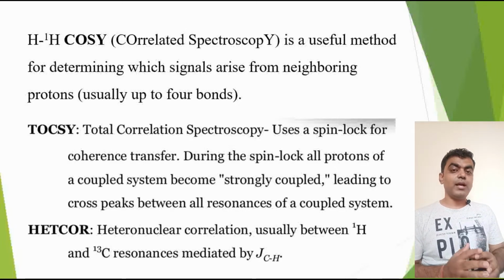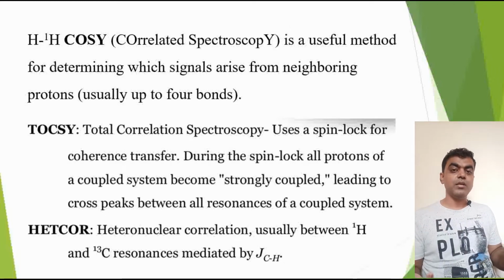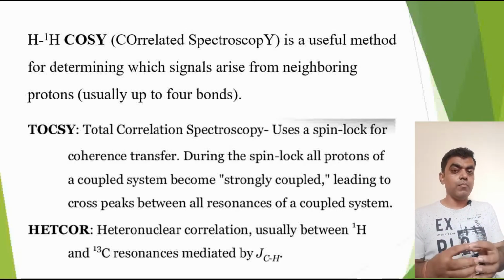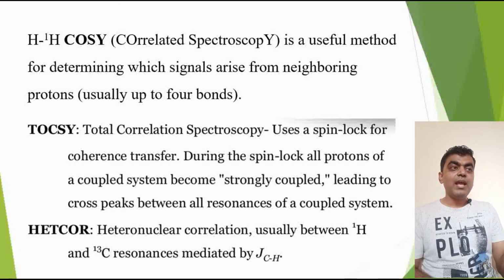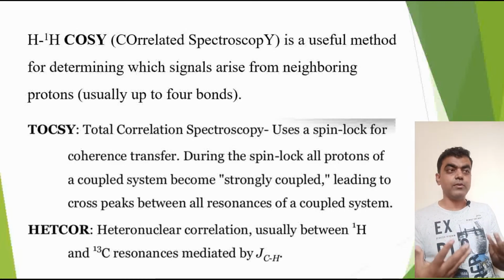Right. So usually when I used to do it, we faced that 3 bond length is very good. We can extend to 4 bond lengths also, depending on how simple or how complex your molecule is, right? So we have to have information on the bond length. Then COSY is the first step which you can do, and you can see the correlations of the neighboring protons in the bond length, right?